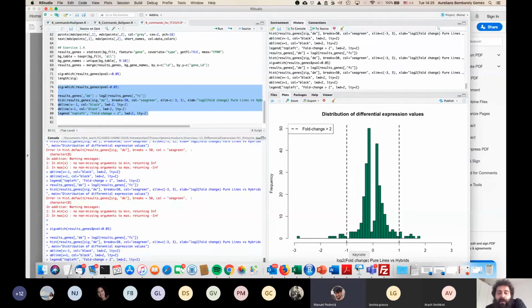Oh, okay. So this is the point. RNA-seq analysis from a statistical point of view is going to give you a lot of false positives because you don't have enough replicates. We are playing with 3-5 replicates maximum.